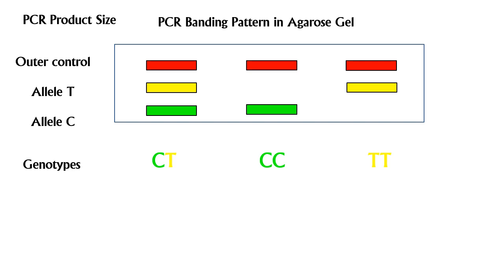We can say this on the basis of the length of this yellow band, which was the length of the primer specific to the T allele. And as there is no presence of the other band, it means that this individual had the T nucleotide on both the genes of microRNA 585 in his or her genome.